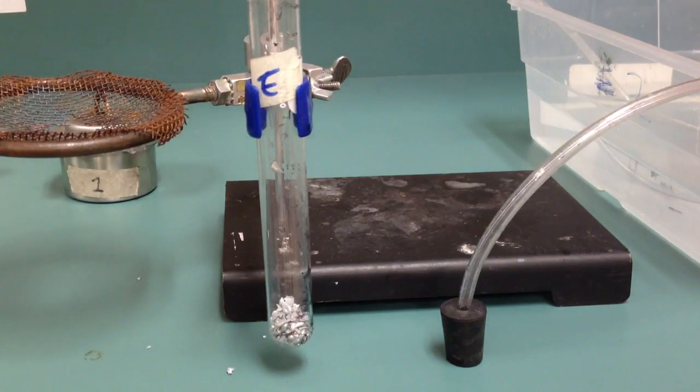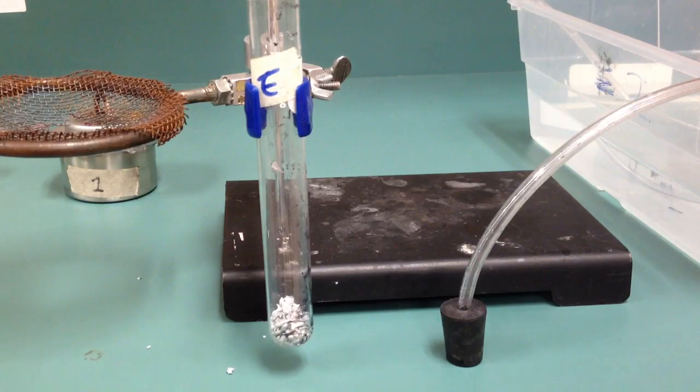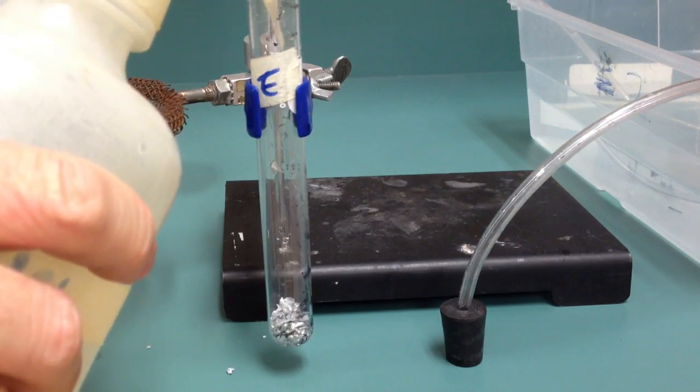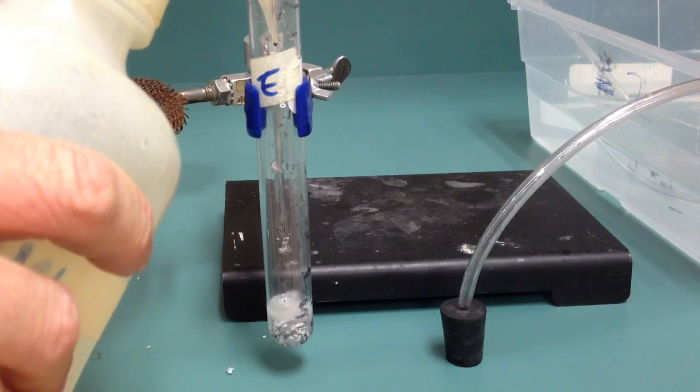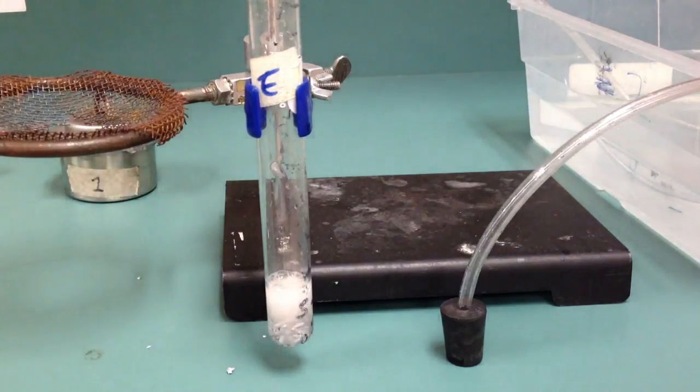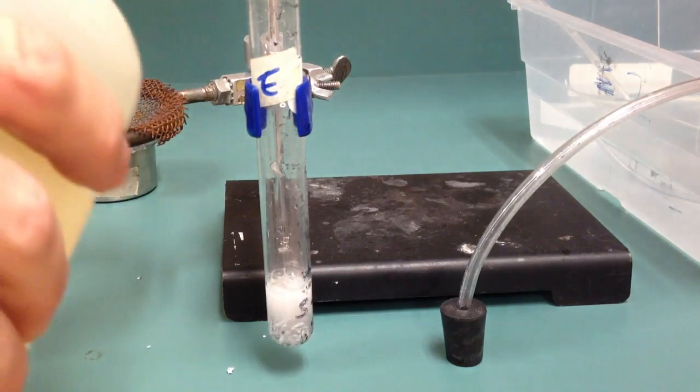Alright, we're going to add a little hydrochloric acid to this, about 8 milliliters worth. In the lab, I ask students to measure it out. I know approximately where 8 milliliters is, so I'm just going to pour it in. So, this is HCl. Hydrogen, chemically joined with chlorine, makes hydrochloric acid.